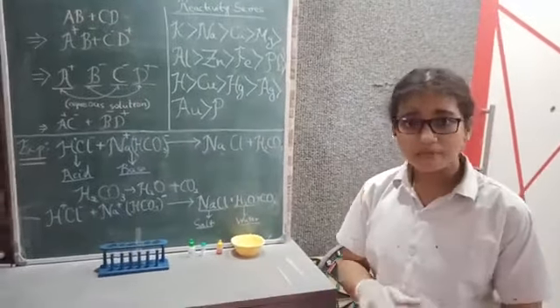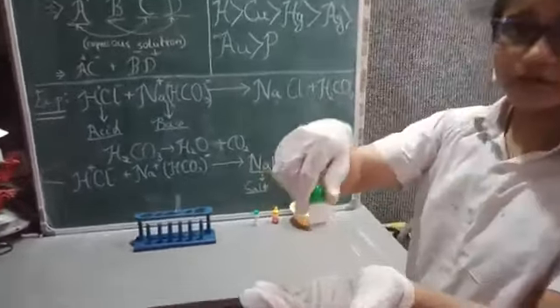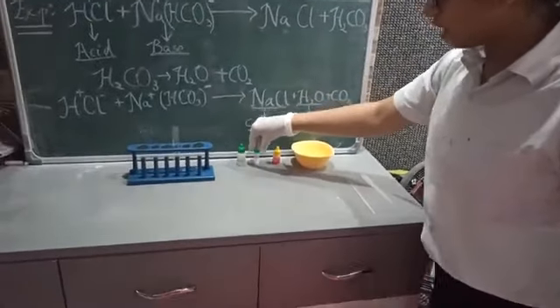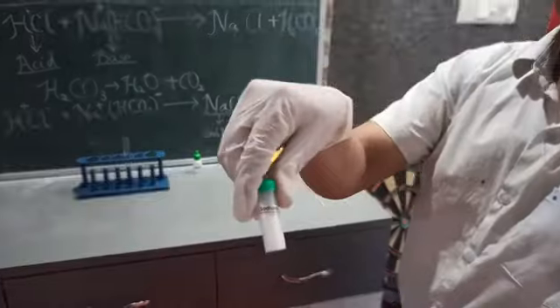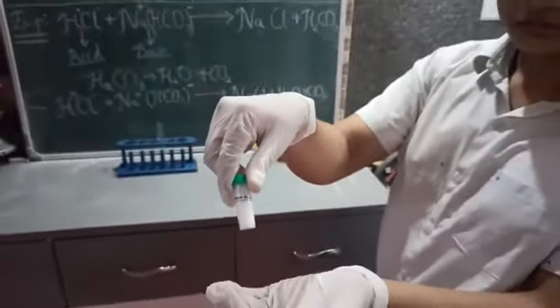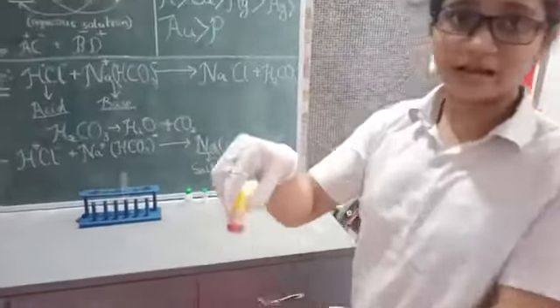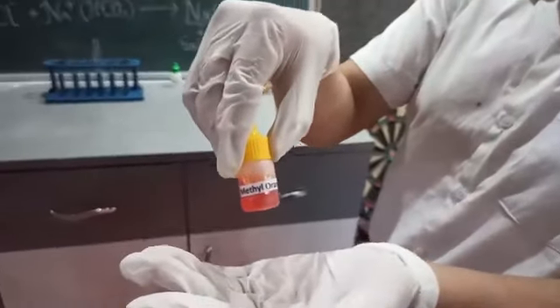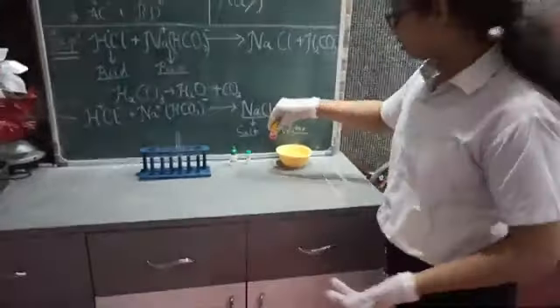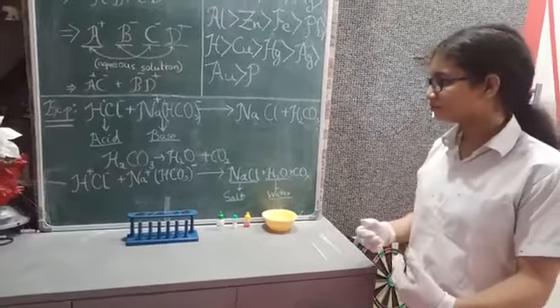So right now the materials required for the experiment are one acid. For now I am using hydrochloric acid, one base which is sodium bicarbonate, one indicator which is methyl orange, and as you may know from my earlier video, it is a synthetic indicator. And you will also need some water because you need to create an aqueous solution.